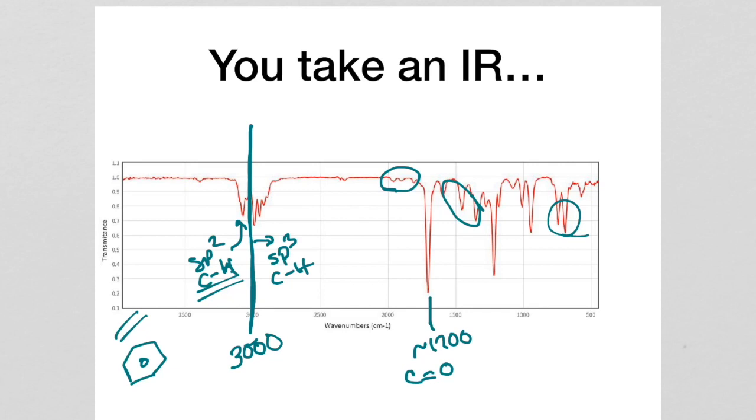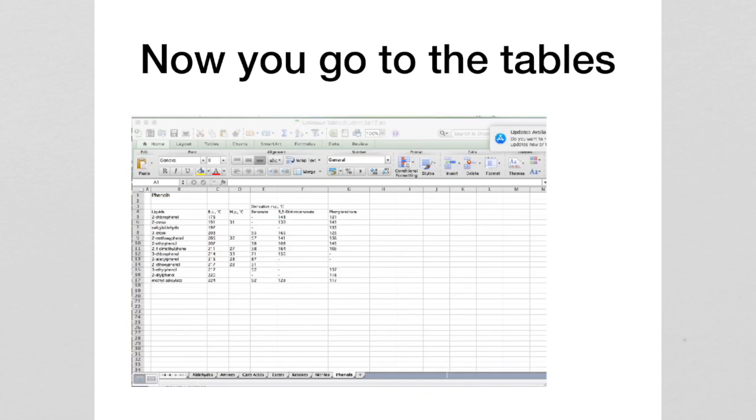And this may not be something that you can see right away, okay? I only was looking for it because I was keeping in mind that idea of the unsaturation. But that may not be something that you pick up on right away. What you probably should have picked up on is your carbon-oxygen double bond stretch and the idea that you've got some unsaturation.